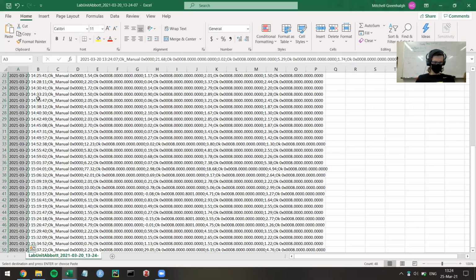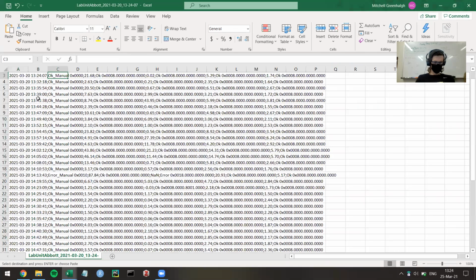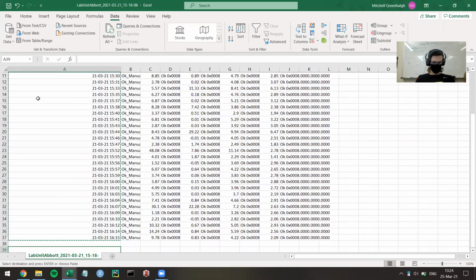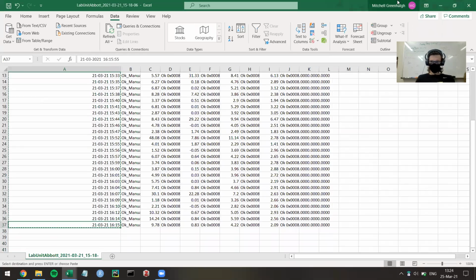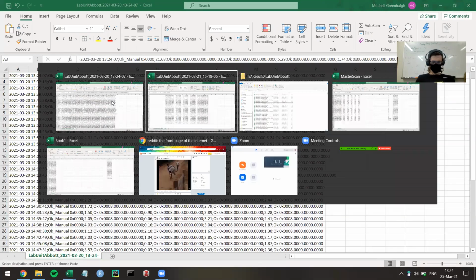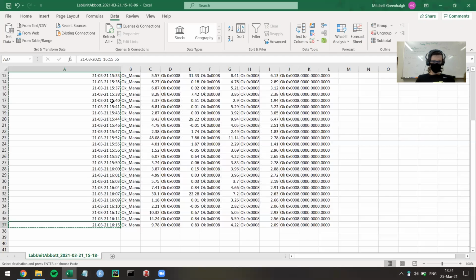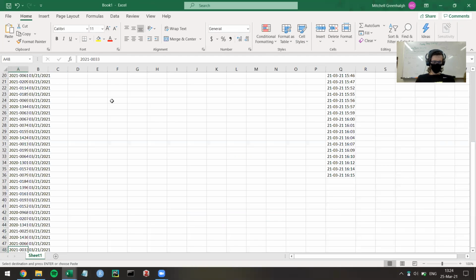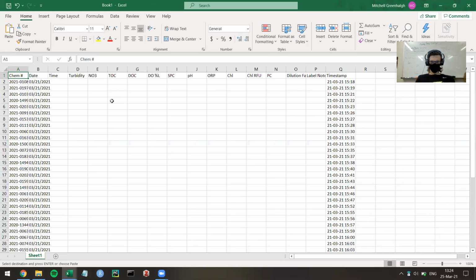All right, so that goes 48. It was run on the 20th. Where am I going? I am here. So this is a good example.